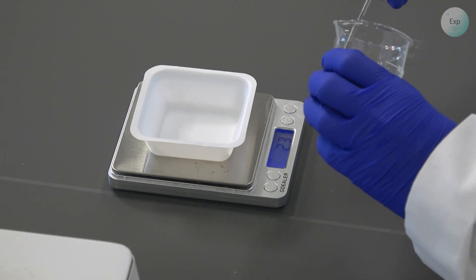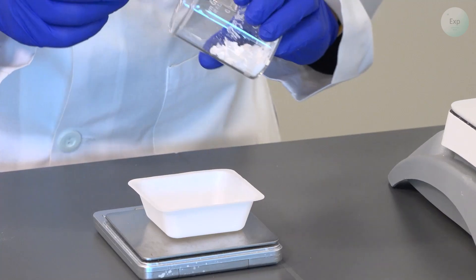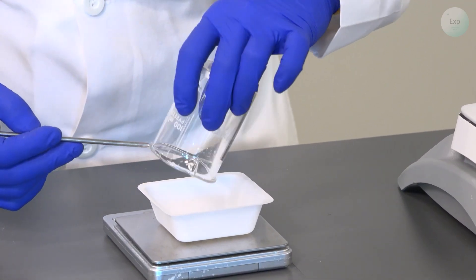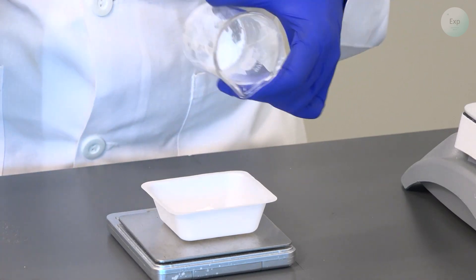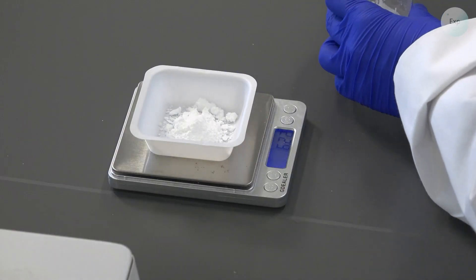So the mass of my weighing boat is 2.31 grams. But I do have some more salt to work with.